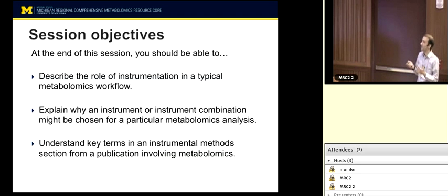Well, it's the same technique. It's just applied in a much more comprehensive way, where instead of looking for the identity of one molecule, we're looking for many signals at once in the data. And I'm not an NMR expert. Kathleen can tell you a lot more about how that interpretation is done and how the software is done. But it's good because it responds to anything with a carbon atom or a proton in it, or any number of other different nuclei which are addressable by NMR. So it's very good for that.